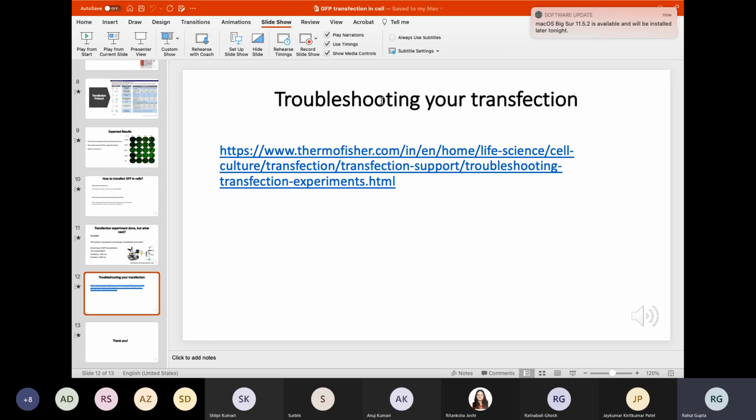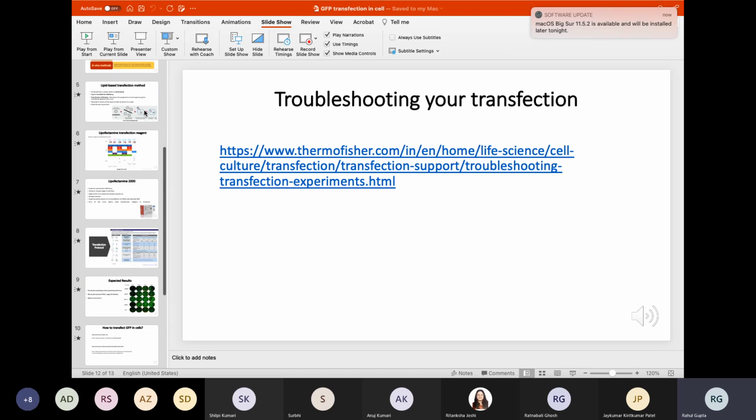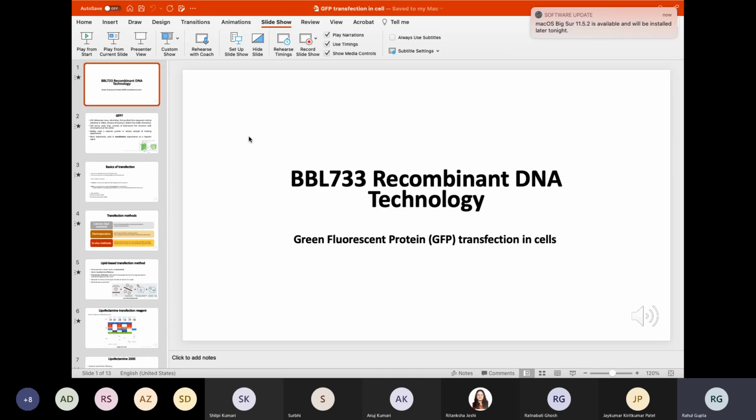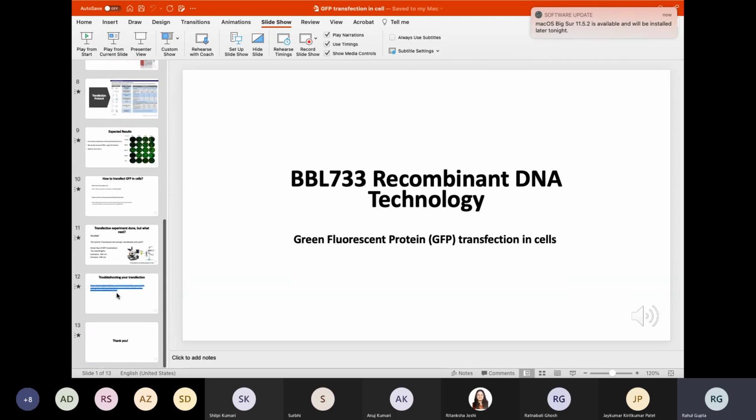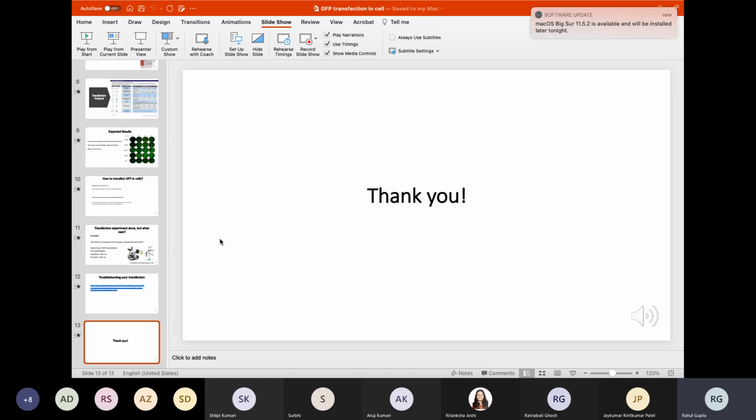later on perhaps. The major message that I wanted to convey using this slide was about how to perform transfection in cells, and I majorly focused on lipofectamine as a transfection reagent, why we use it, and what conditions have to be optimized. We just went through one small video wherein we can have a look at how exactly these things are done, because without seeing a video we cannot perhaps appreciate how all the protocols are being followed. So this brings us to the end of lecture 1.